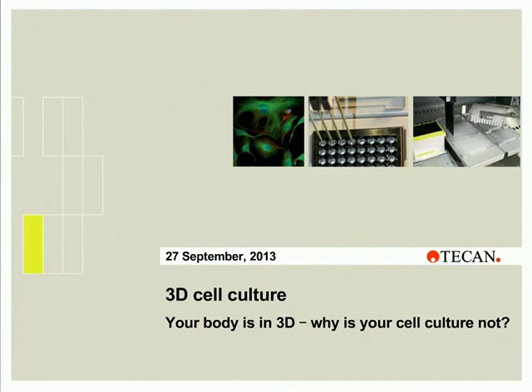With 3D cell-based assays increasingly important in life science, this webinar will explain the automation of a 3D cell culture and will discuss a long-term live readout of the latter with a microplate reader. 3D cell-based applications close the gap between conventional in vitro approaches and in vivo animal model research. Automating the 3D cell culture process and assay detection in a microplate-based format significantly shortens time of new drug candidates, as well as offering more reliable statistical results.